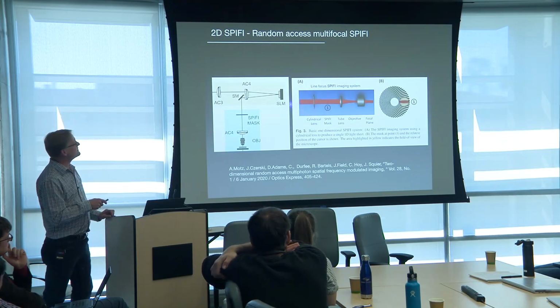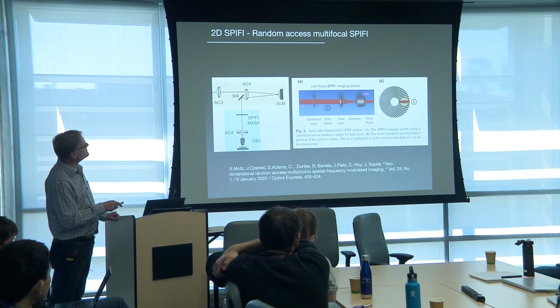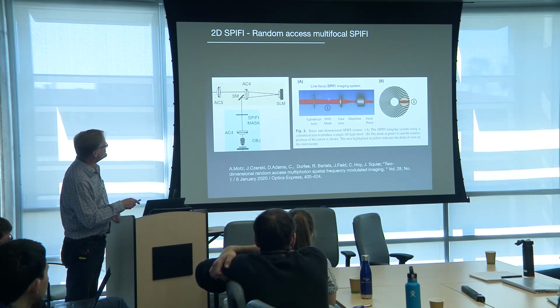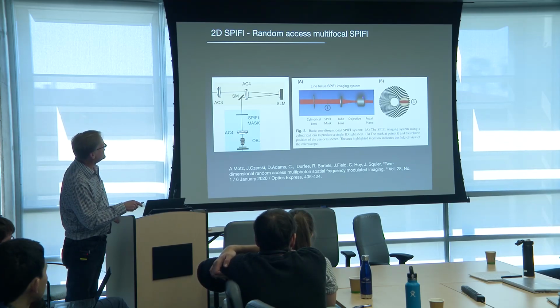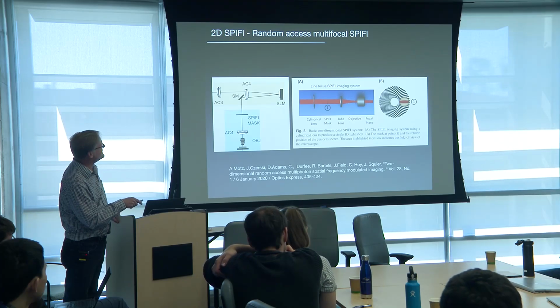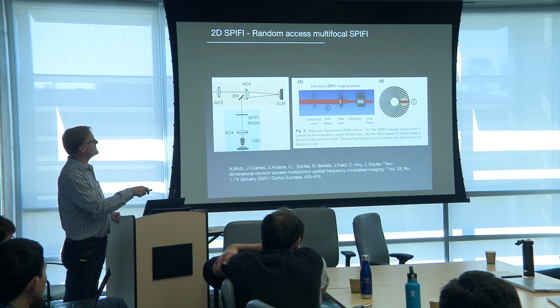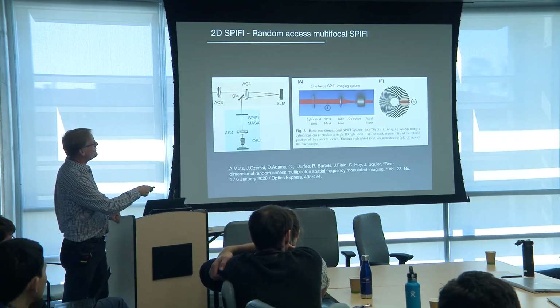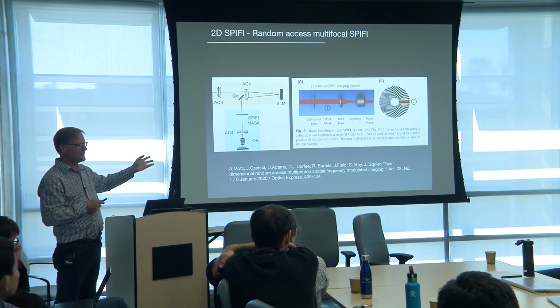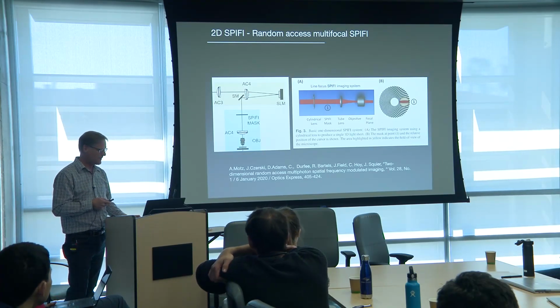Okay, so now I want to just take a look at where our spiffy mask is. And here's our traditional system. Cylindrical lens creates the light sheet. There's our spiffy mask, and that gets imaged all the way back here. But we really had the realization that, wait a second, this focal plane, that zone, conversely, and I'm killing the laser, it gets imaged all the way back to that yellow zone on your mask, backwards. So we really have the potential then to do complete two-dimensional imaging with this system.